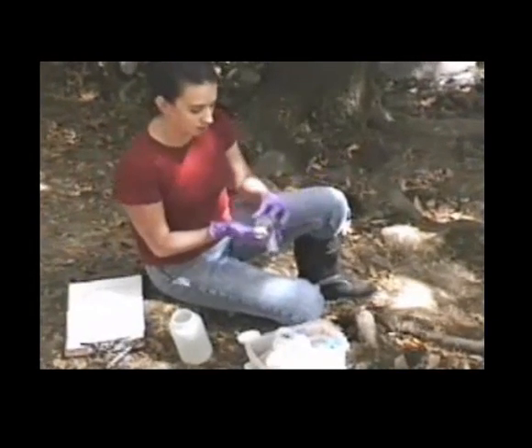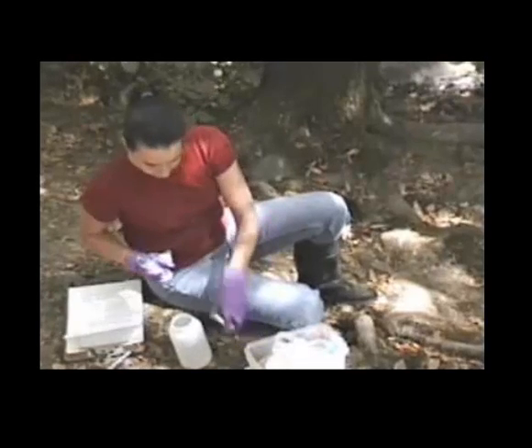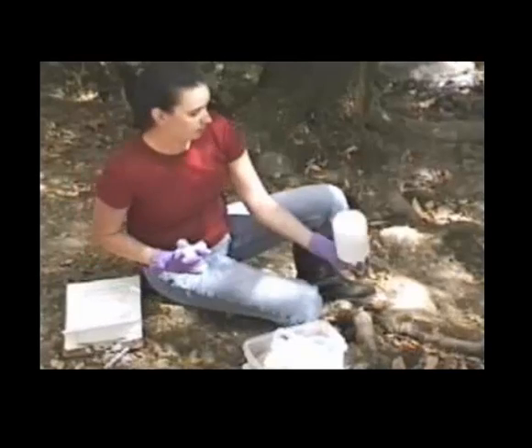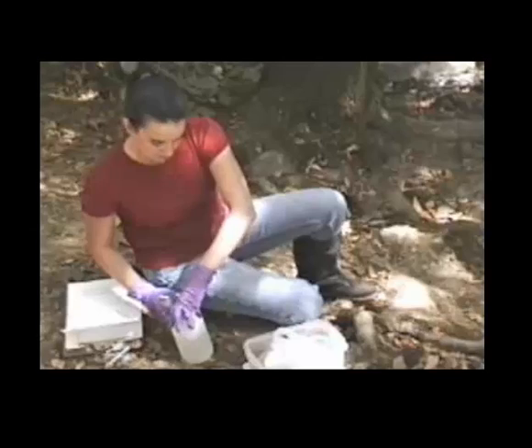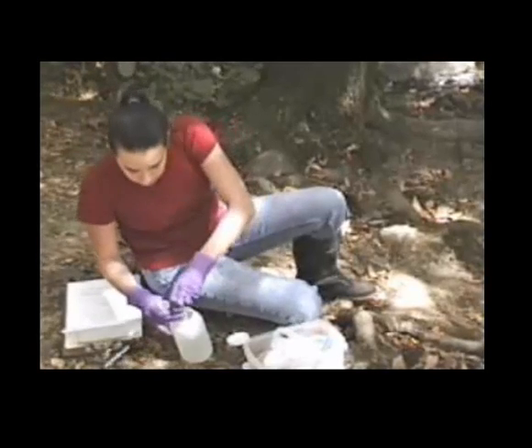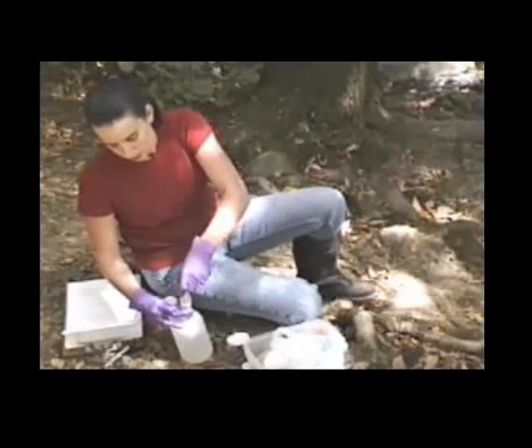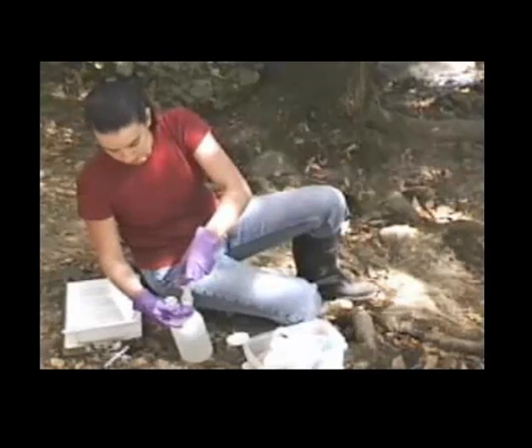It's something that needs to be recorded at the end. So for this sample, we're going to use 2 syringefuls, which is 120 milliliters.